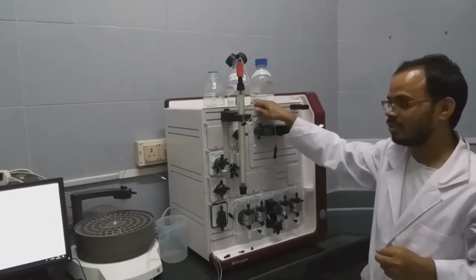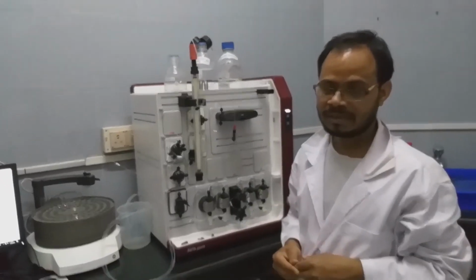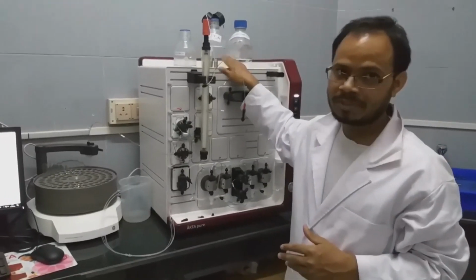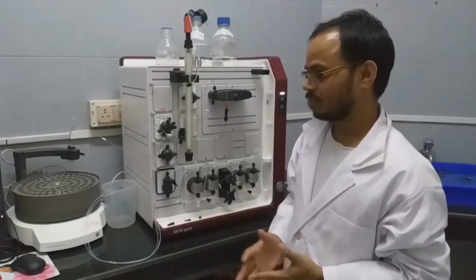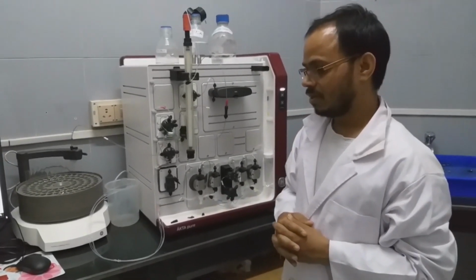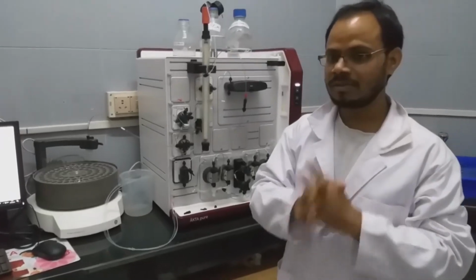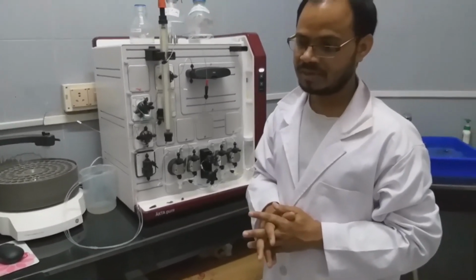So we changed into water. Now we can connect it to the column. Here also some precautions need to be taken. If you are using chilled buffers, suppose you need cold buffer, that means you have to bring all the components of the system to the temperature which you want to use for your purification.